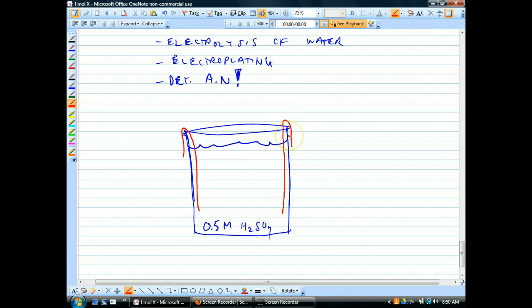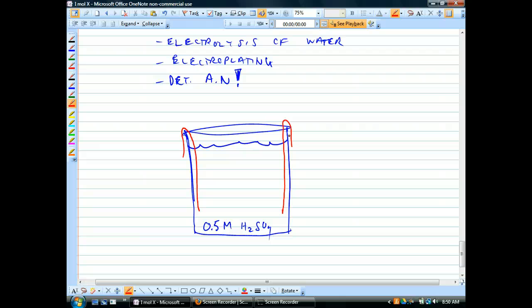So these are the copper wires, and this is my acid. I just take two wires. You'll probably have to adjust the lengths during the experiment. Mark the wires differently - like twisting them in different ways - so you can identify which is which. When I put the wires in, nothing happens, because this is an electrolytic cell. Both wires are exactly the same - copper wire in sulfuric acid - so why would anything happen? We need to put electrical energy into this.